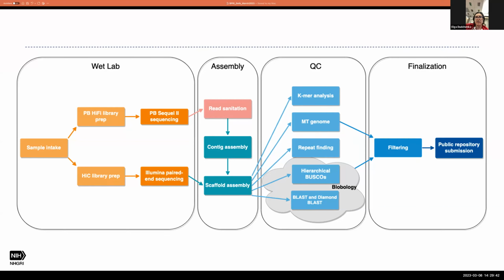And then I never had to deal with demultiplexing. Does that happen automatically on the PacBio instrument? Yeah. Okay. So you just get reads back. The naming convention's a little different, but it's all on the instrument.